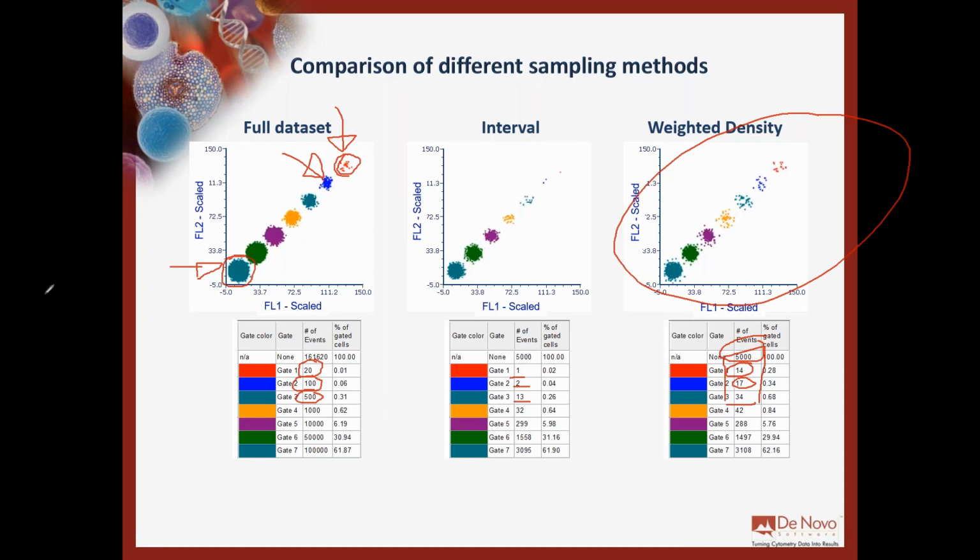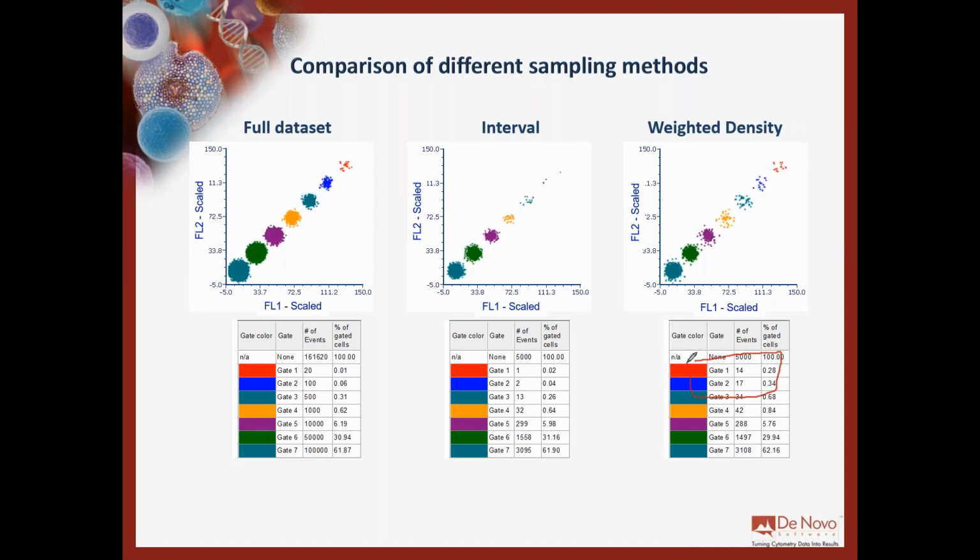And you see the price you're paying to enrich those populations is not that high. You see here, instead of 3,000, almost 3,100, you're basically sampling the same. Instead of 1,500, you are basically sampling like 60 less.